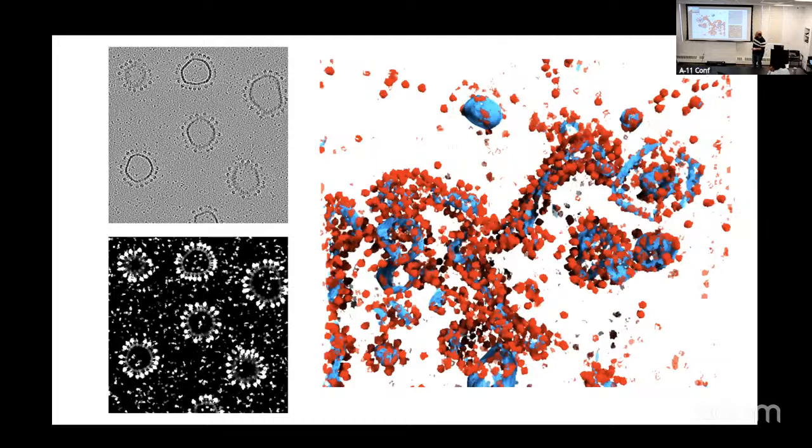You have membrane-bound stuff. This is ATP synthase over here. So this is segmentation of a real tomogram of, what do they call them? They're like mitochondrial vesicles, right? So these are basically the inside cristae sort of stripped out of a mitochondria and then plunge frozen. And so I just took our vesicles and jammed a bunch of ATP synthase into them and trained a network to find both the membrane and the synthases. And it does a surprisingly good job. I mean, I wouldn't do that by hand. I would never even try to do it, to be honest.